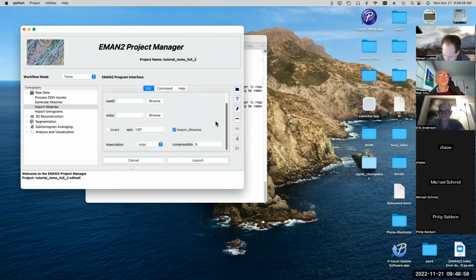The motivation for writing that paper was the paper that came out of NYSBC on JPEG compression, right? Where they said that you should just store JPEG images, and they're probably good enough to get something, even if they're not perfect, which is a kind of true statement, but there's all sorts of other nasty things about it. So the paper sort of started as a don't use JPEG paper. But then we also covered all of this stuff. Anyway, okay, great, thank you.